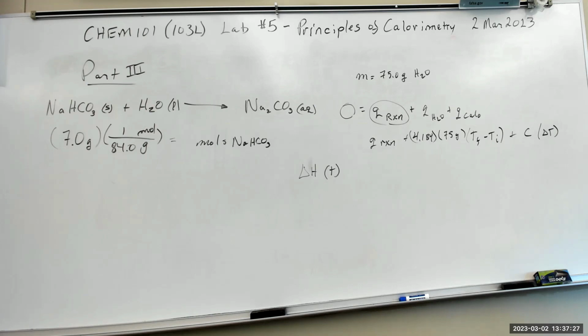Sodium bicarbonate, 17.15 is the accepted value. I don't know why we threw the sodium chloride in there. Probably because it was built into the table. But those bottom 3 are the only ones you're going to need to work this out.